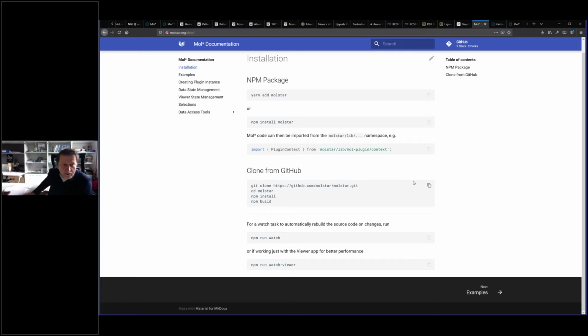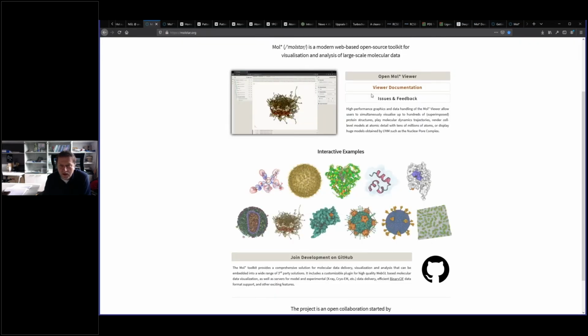Okay, David, thank you very much. It's very impressive, and I think most of the users acknowledge the speed of the viewing of the molecules. I'm looking for some questions, and the first is my own. If you look at the protein families, are you able to also see the sequence conservation in those families, and is it possible somehow to visualize it?